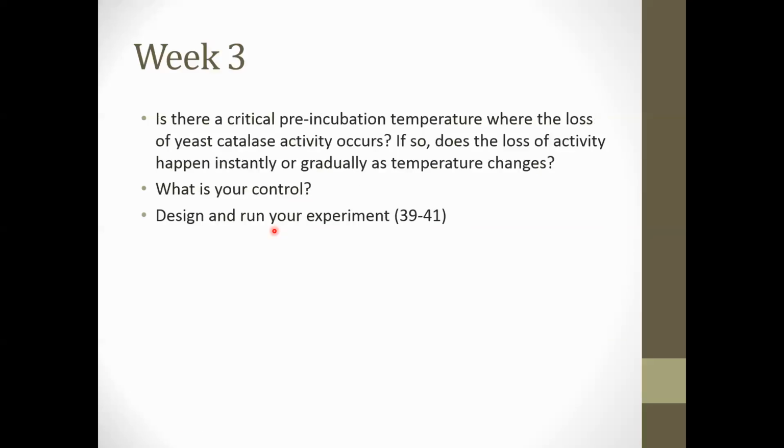The third set of experiments that we'll do is examine denaturation of catalase in detail. And you'll answer the question, is there a critical pre-incubation temperature where the loss of yeast catalase activity occurs? And if so, does the activity happen instantly or gradually as temperature changes? So is that protein breaking as soon as you cross a certain temperature threshold? Or does that enzyme slowly bend out of shape as hydrogen bonds and other bonds break as energy is added until the enzyme finally fails?